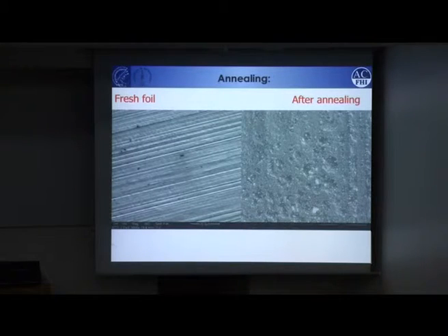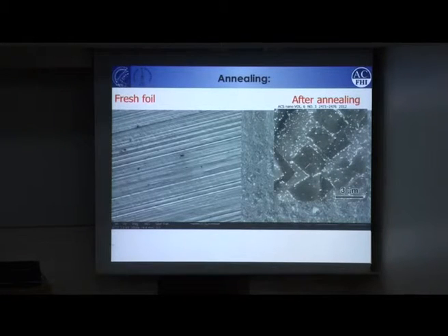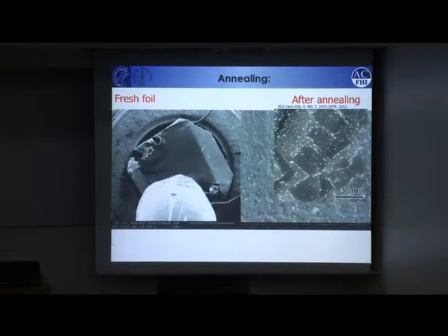This is a rolled foil as we buy it, and we did the annealing process just to see what happens. And we also knew from other publications, this is from the literature, you see here this is graphene, the darker things here, and you have lots of white particles. We knew it's a common problem, so let's see what happens during annealing. In our microscope, it's not a quartz furnace, it's just an SEM with a gun. So let's see where the silica particles come from.